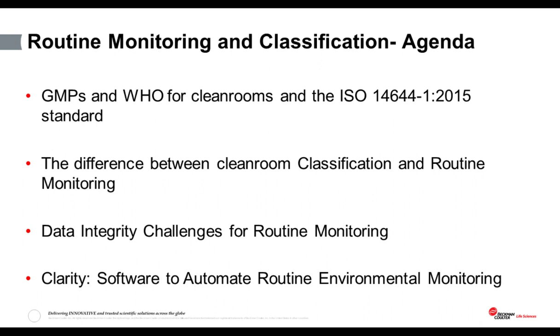So in today's short webinar, I will cover the GMP requirements for cleanroom monitoring and the requirements for classification and explain the difference. I will also outline why routine monitoring presents such a challenge to data integrity. And finally, I'll give you some brief highlights on the new Clarity software for routine monitoring and how it can automate these programs and help reduce data errors.